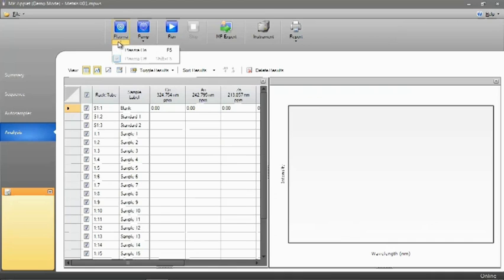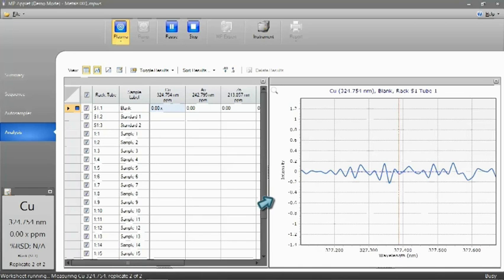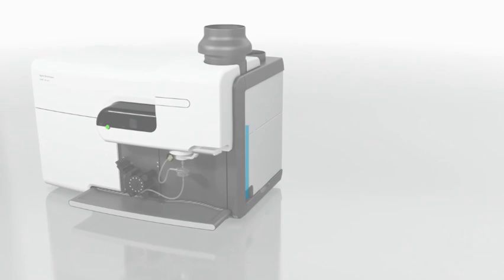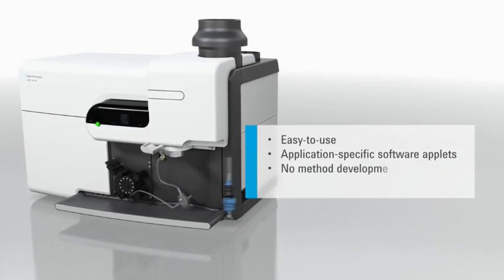The intuitive Agilent MP Expert software has application-specific software applets, so you can load a preset method and start analysis quickly without method development, alignment or training. Experienced users can access express method development and auto-optimization tools for fast setup. The torch loader automatically aligns the torch and connects the gases, eliminating alignment and ensuring reproducible performance with quick startup.